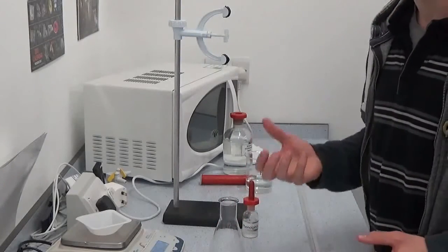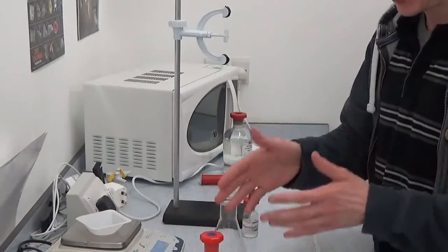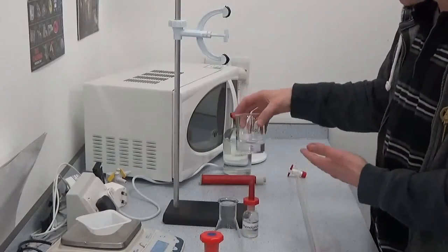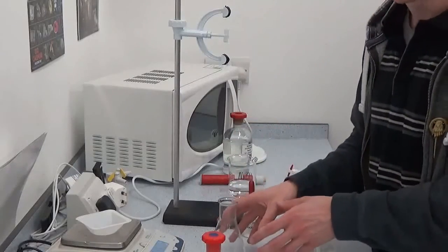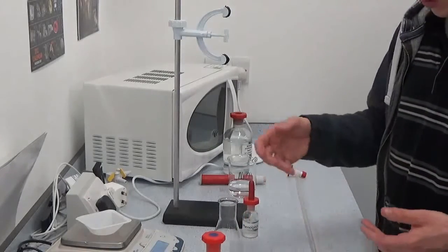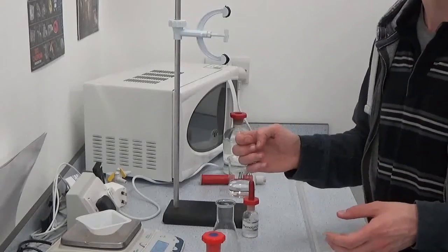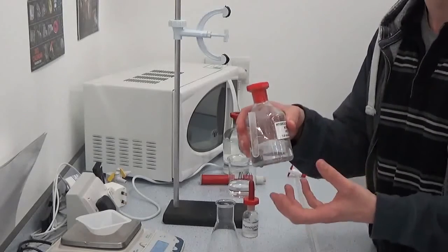Now the key factor in a back titration: when I'm adding this hydrochloric acid, the acid must be in excess. Calcium carbonate is a base. If I react that with sodium hydroxide, well it won't — it's base-base effectively. So I need to fully neutralise the calcium carbonate with the hydrochloric acid. That 1.5 grams — some of it is not going to react, but I'm going to assume all of it will, because then I know the amount of acid I add will definitely be in excess.